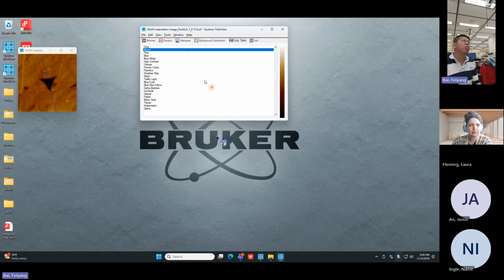And one more question, Laura. For this imaging, is there a, how should I say, sensitivity or the roughness range that this tip can handle? Well, it's more that piezo scanner, right? So we were talking about that Z. So can you bring TriboScan back over to this screen for me? Please.